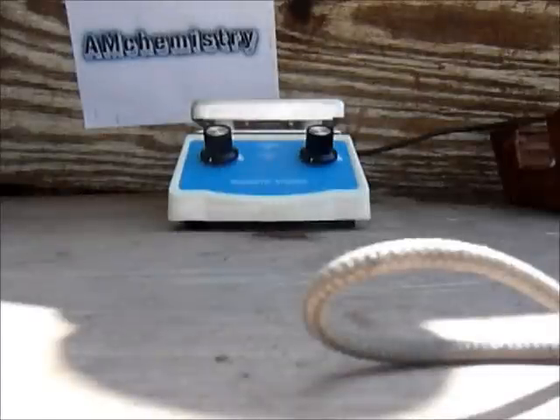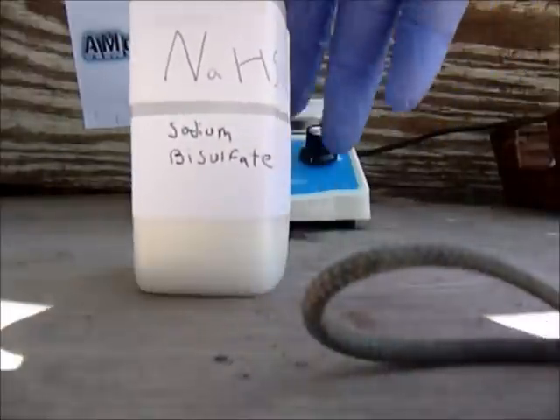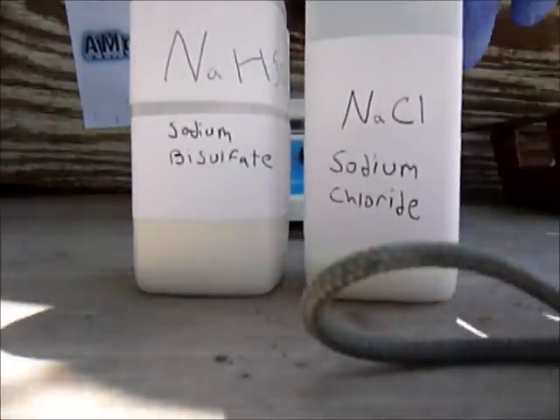Hi guys, today I will be showing you how to make hydrochloric acid the second way. It will not be the sulfuric acid and salt method. The method we will be using today is the sodium bisulfate and sodium chloride method. The chemicals you will be needing are sodium bisulfate and sodium chloride.